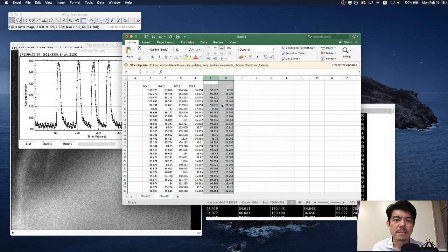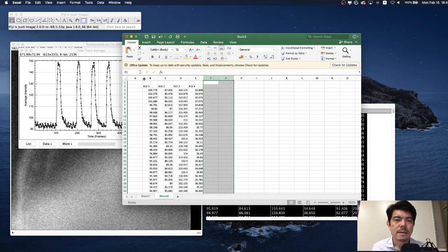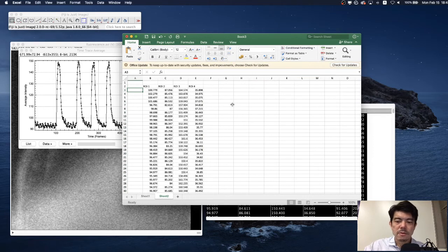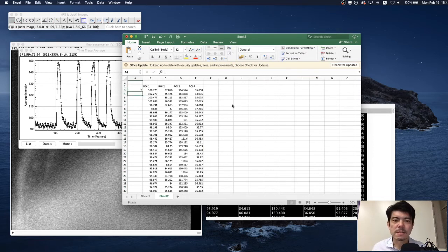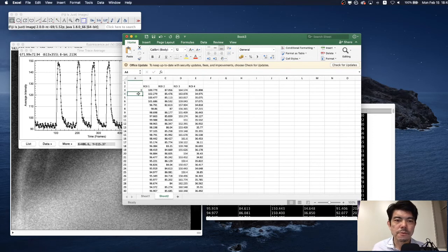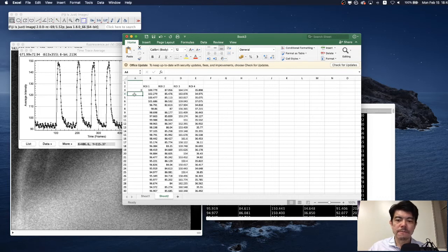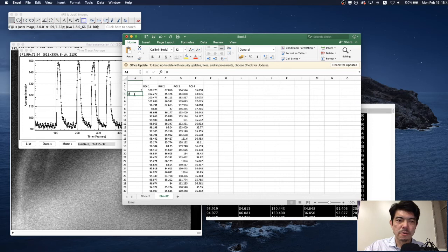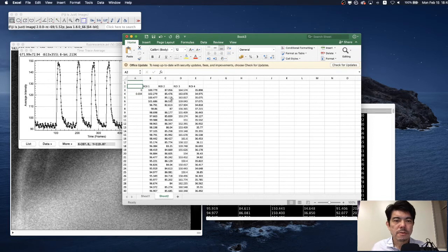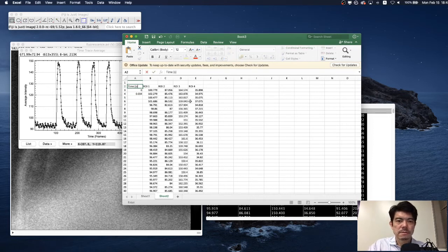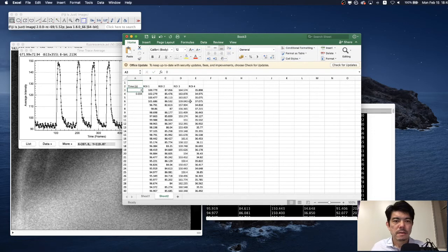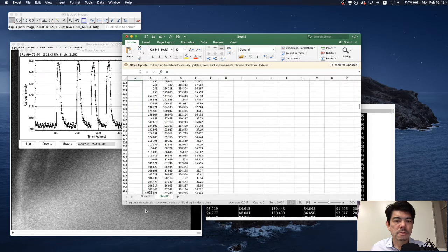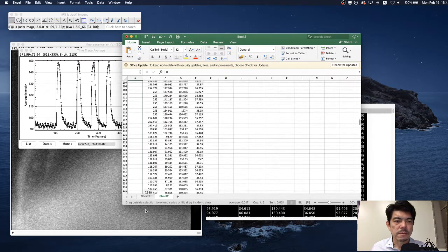Another important information is time. Let's say that the time at the first frame was 0. And because the interval of this movie was 34 milliseconds, enter the time in seconds 0.034. This is time in seconds and we can drag this down to the end of the frames.